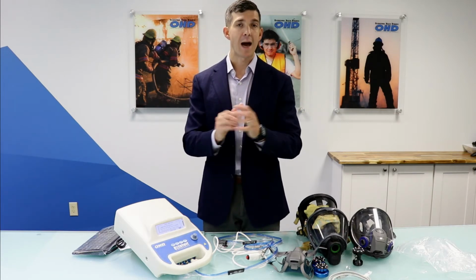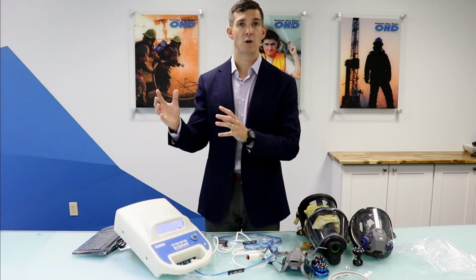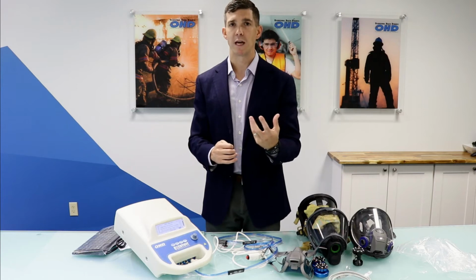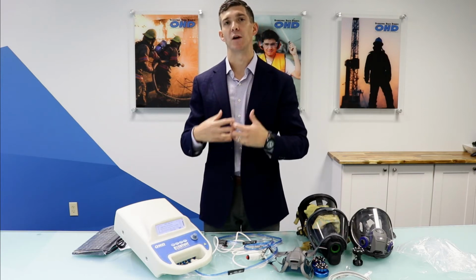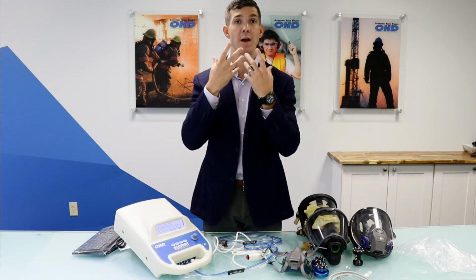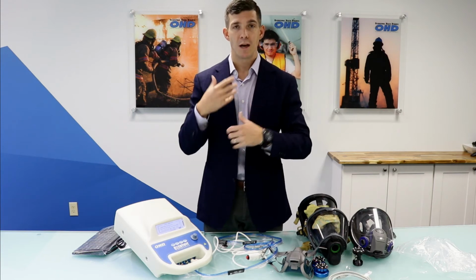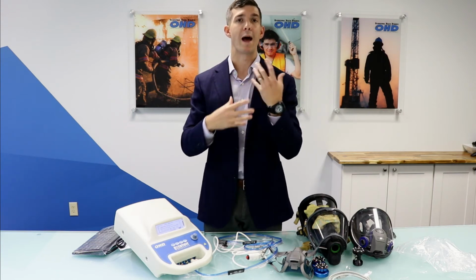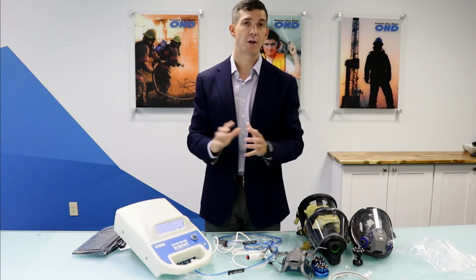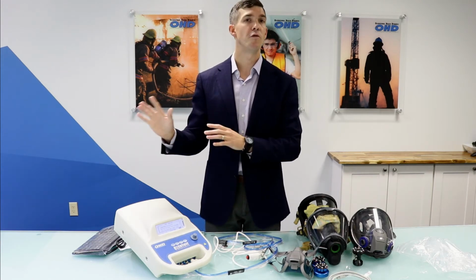Now you need to look at your guidances that you're using. Most every regulation requires for aerosol fit testing or even qualitative that you have to do a purge of the mask when you have the filter on, because if the person has donned the mask with aerosol inside of it with particles, or if they have particulate in their lungs, they have to breathe and work that out of the mask. With controlled negative pressure, we don't measure particles, we're measuring air leakage, so we remove those requirements.